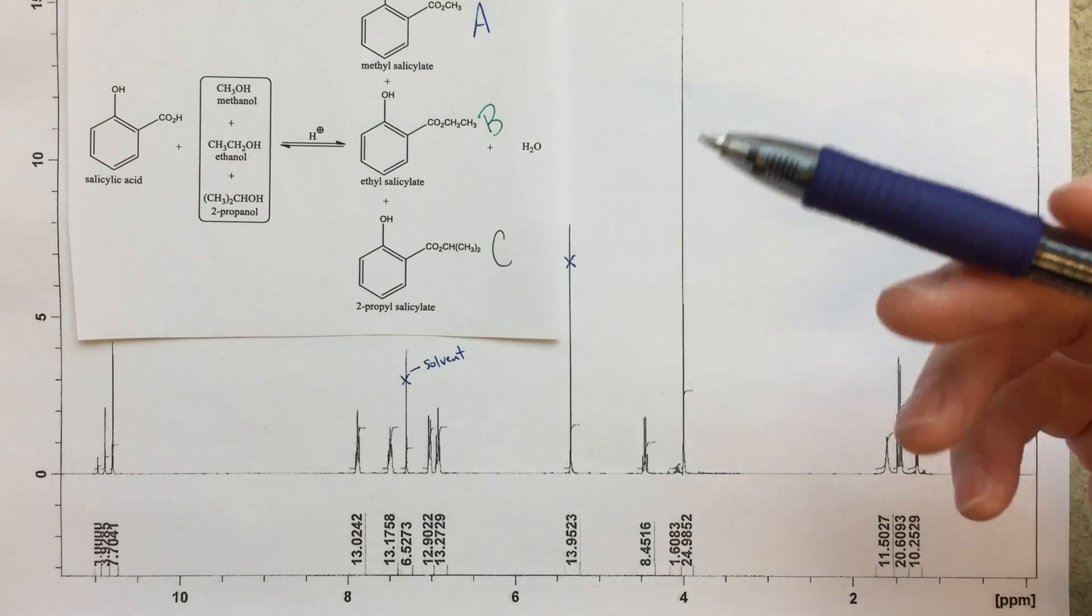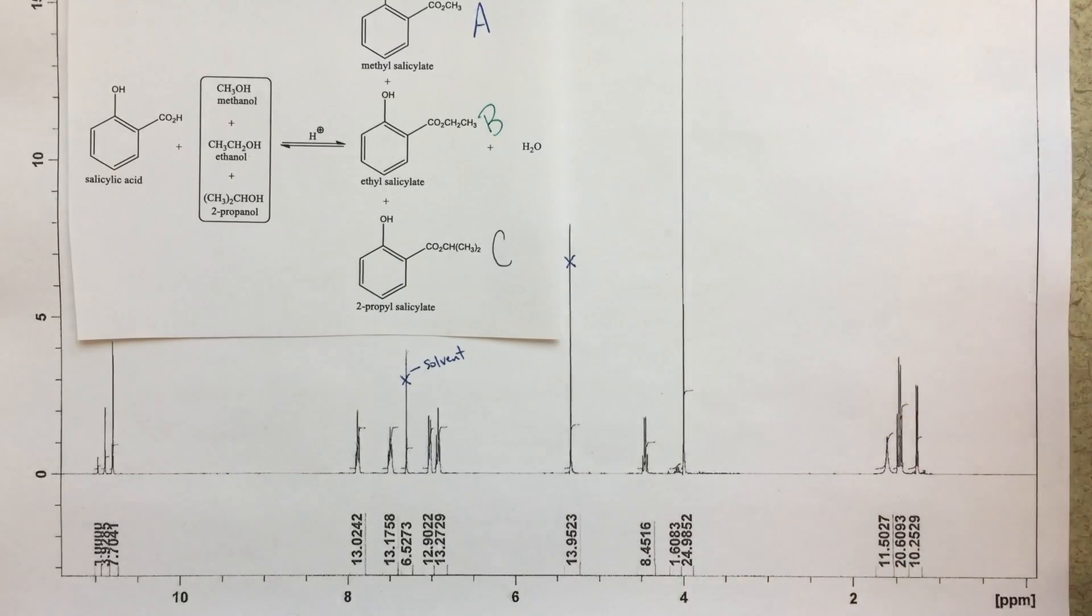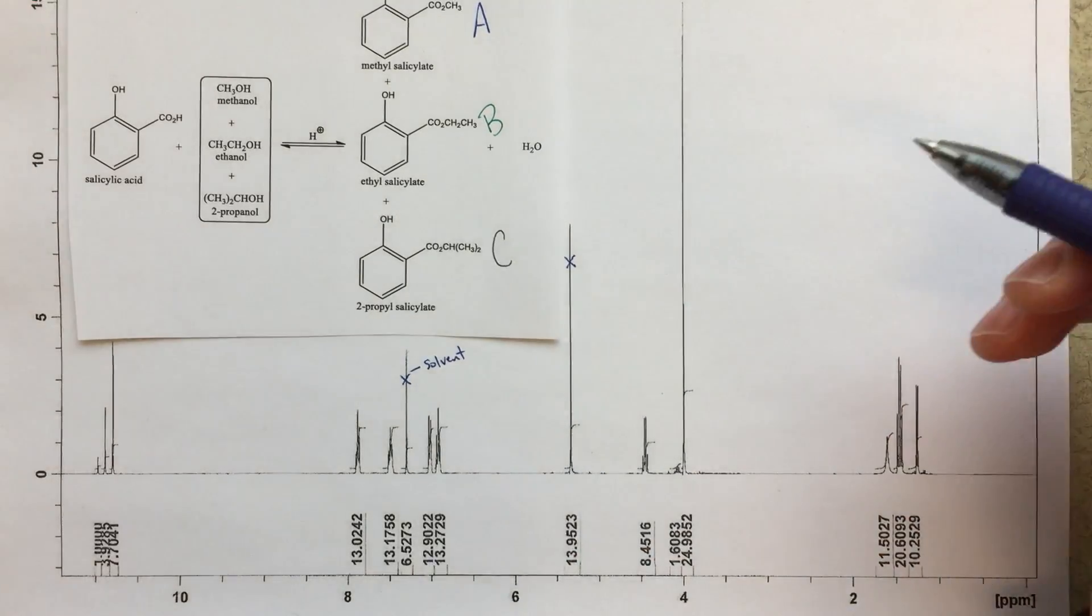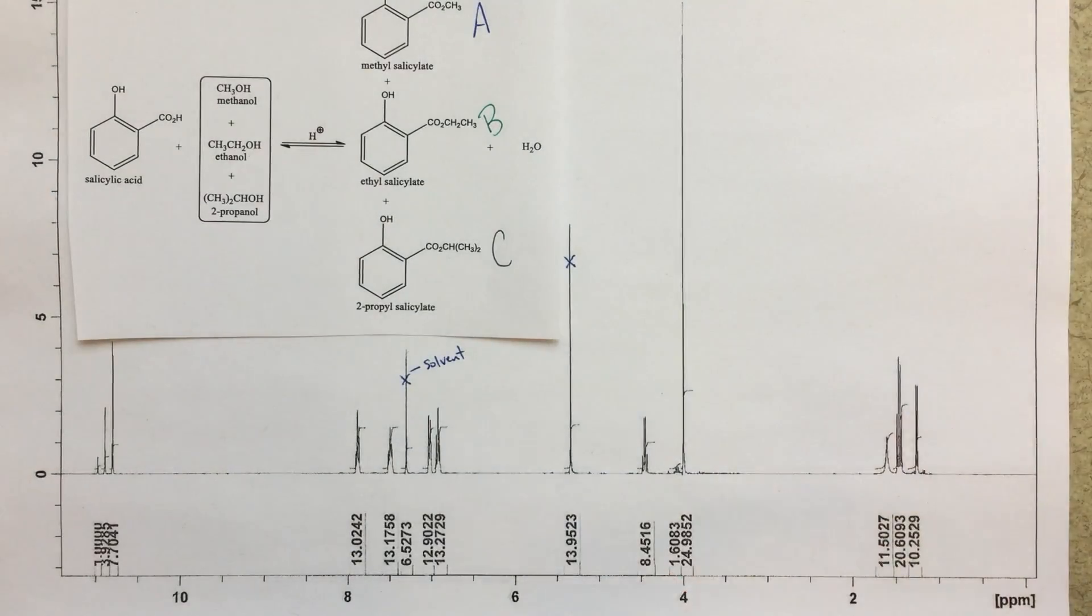But this is what the student told me. So we can assume that it's something we don't need to worry about, it is some impurity. So we're just going to ignore that problem. It could be DCM, but not exactly what I'd expect. But it could be some other solvent, so that's fine. We don't need to worry about it.